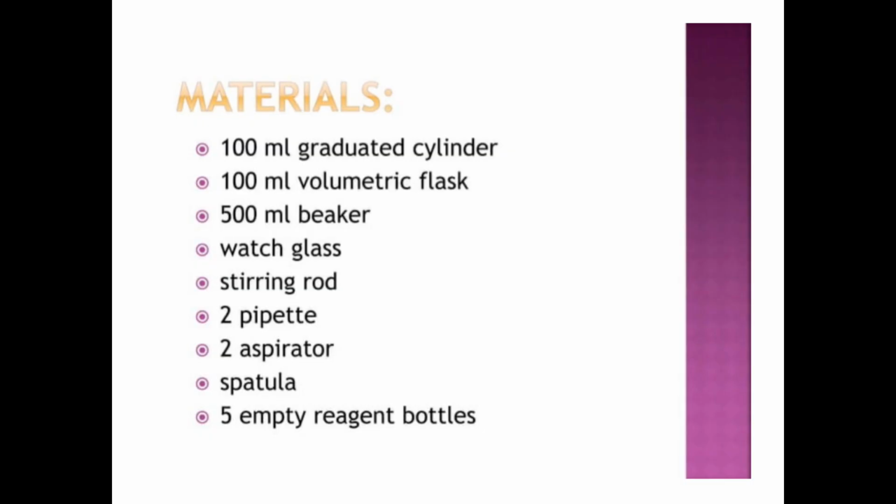Depending on whatever is required for you to use, you can use 100 ml, 50 ml, 200 ml and the likes. But the ones that you see here are specific to the ones we want to prepare. But your graduated cylinder can be of any volume, as the case may be. So you are going to also need a standard flask to prepare standard solution.